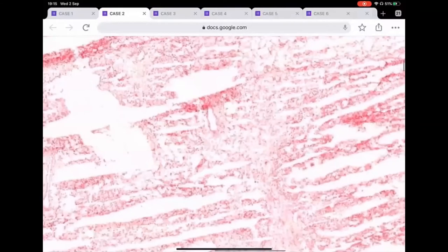You still wait and see, because I cannot determine anything on this, but if I waited a little bit more, I might say, okay, there might be some tubules here in the corner. I might be dealing with this problem, which is there is some renal tissue on one side, but in the middle, I'm not appreciating a lot of renal tissue.